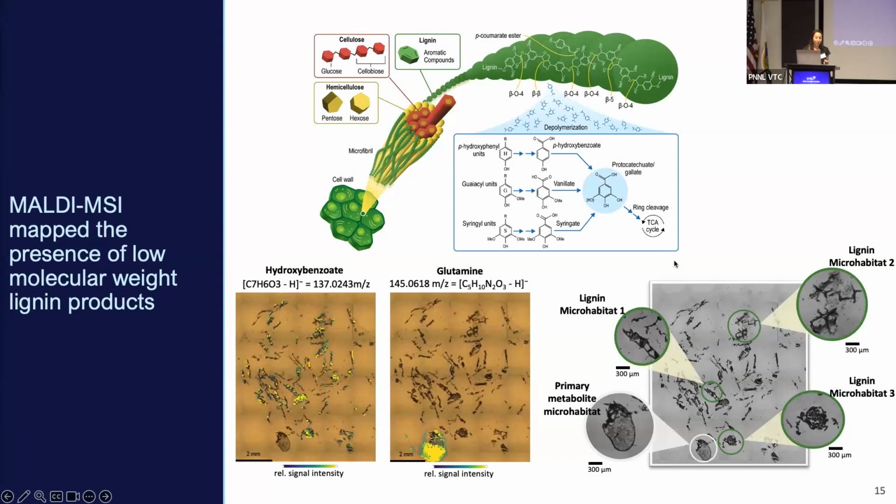There is also one spatial pattern that was really widely observed. It was really abundant in our data, and that spatial pattern was only localized in one specific feature. Basically all metabolites annotated to that one were primary metabolites. Looking under the microscope, that feature looked to us like it could come from ant, because it looks like an ant wing or ant egg. So we also wanted to profile that one by spatial proteomics, just to see what it is.